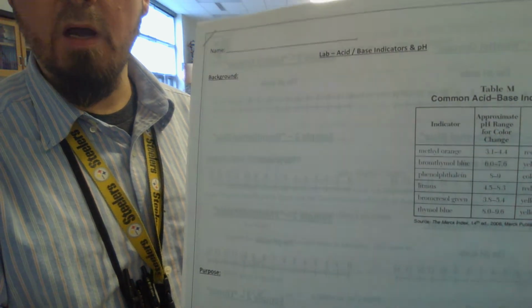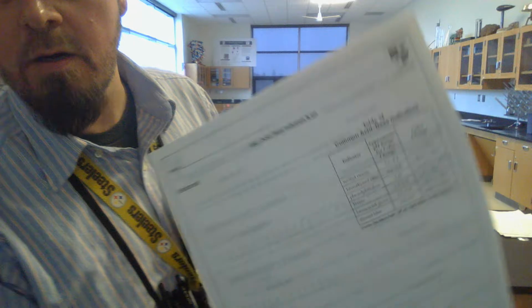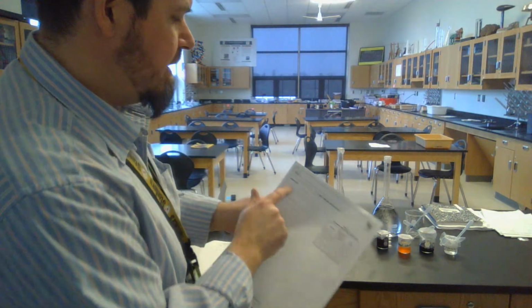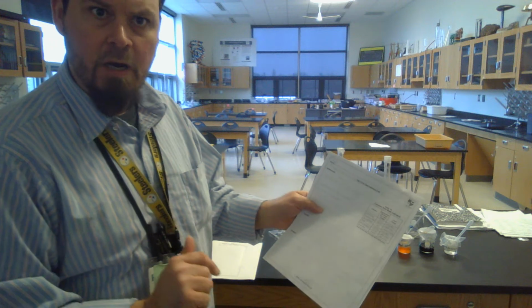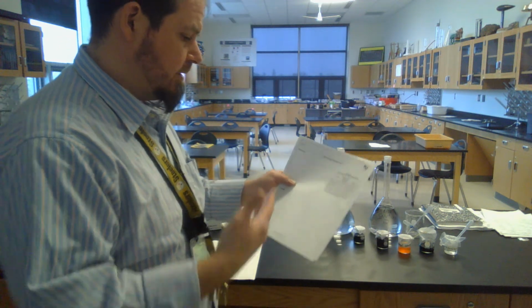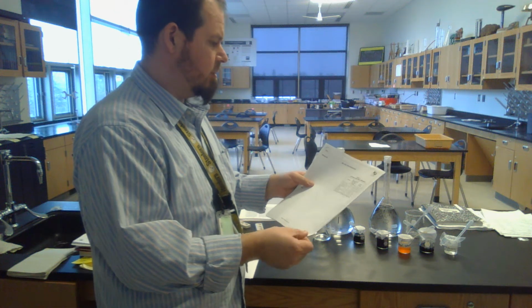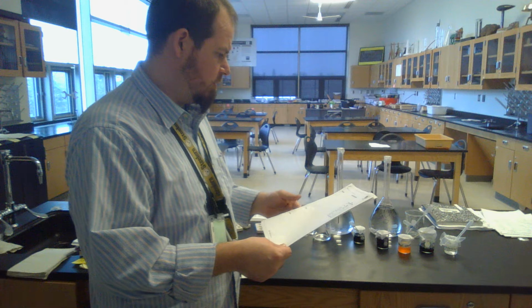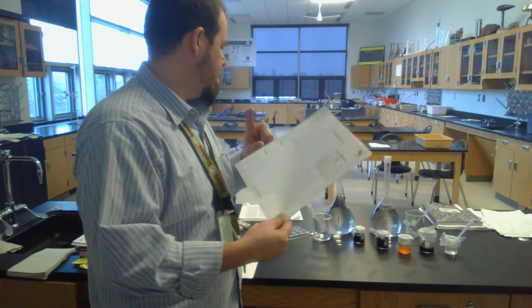Hey everybody, acid-base indicator lab. Here it is. Check it out. We're gonna do this lab today. Indicators. You're gonna tell me what an indicator is, and we learned earlier in the unit that it's a special chemical that's gonna change colors with pH and that kind of thing. So you're gonna tell me what you can about indicators.